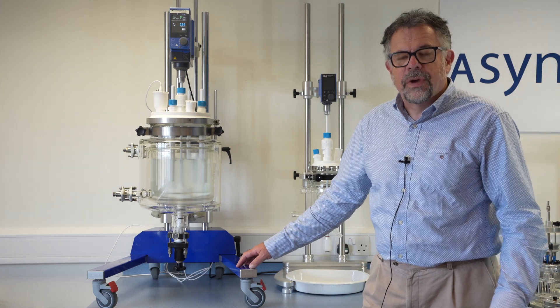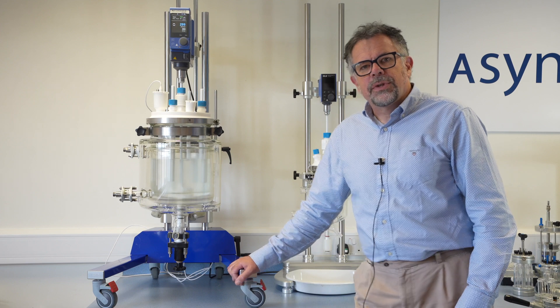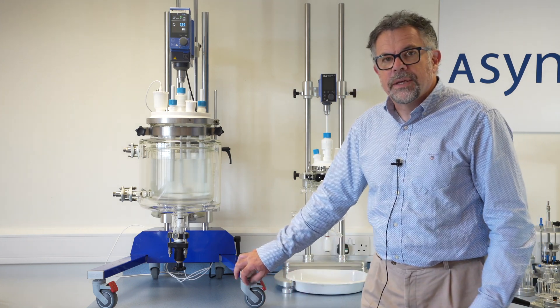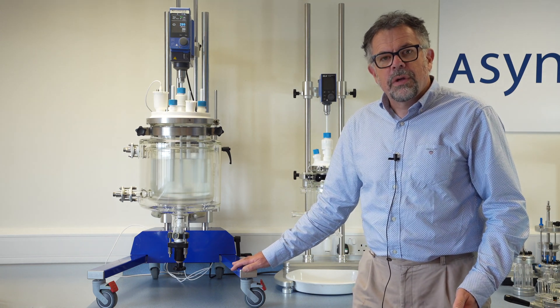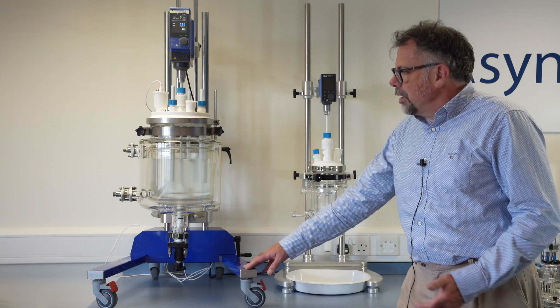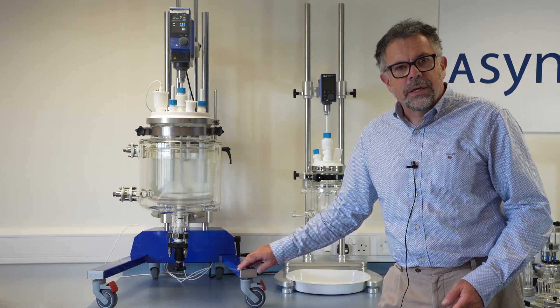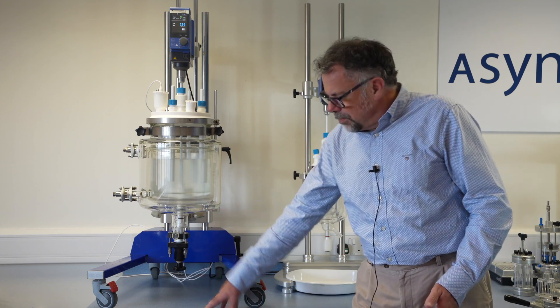Let me tell you briefly about some of the unique features of Atom — if you want to find out more, there'll be links below. The first thing to mention is Atom was designed to be used in two ways: firstly in a walk-in fume hood, hence the casters, but you can remove these, put on short feet, and the system is very suitable for use in a standard fume hood. It was designed with that in mind with a large pharmaceutical company who wanted to work with around 10 or 20 liter vessels in the standard fume hood. The problem being the height the vessel would need to be above the bench top.